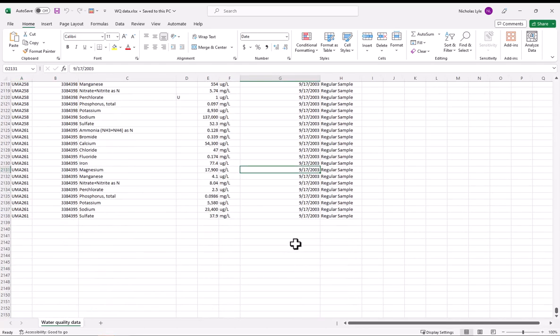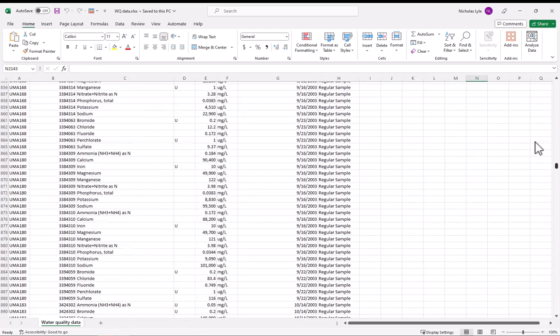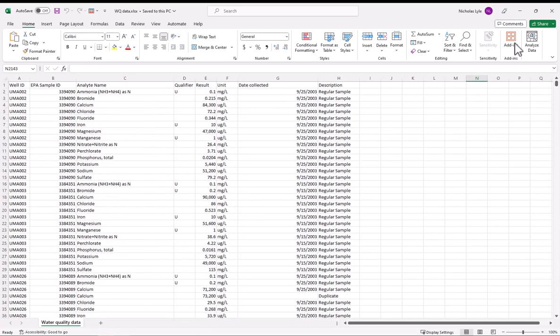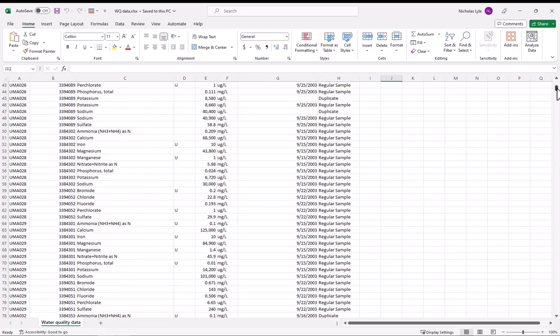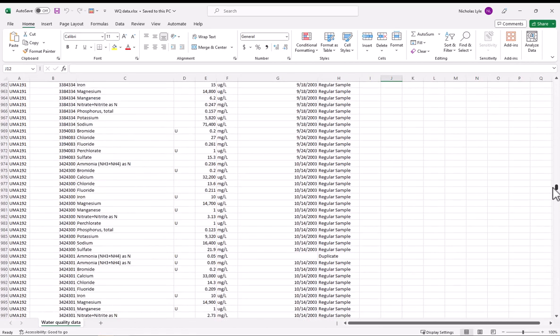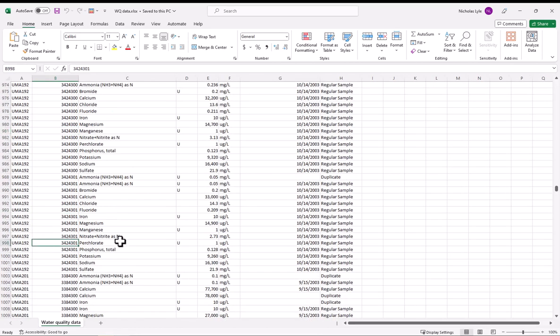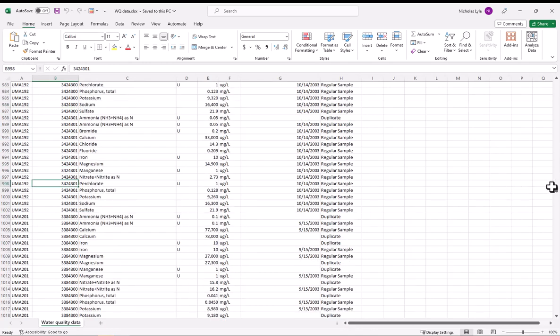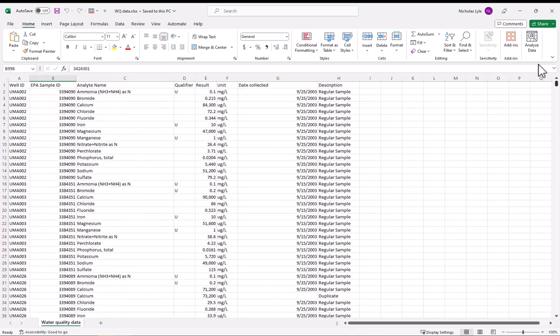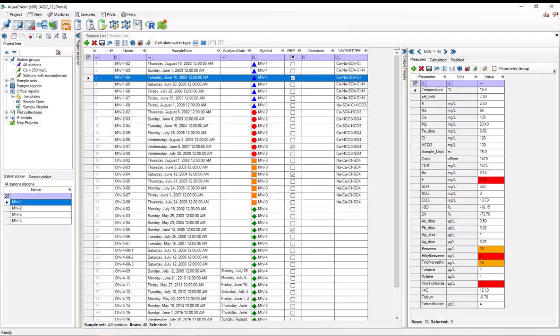There's no extra columns. We don't have things in here like, you know, row 1000 is another row of header data and so on. It's just one header and all of our data. There's some more preprocessing that I could have done here, but I'll talk about that during import. And I'll just go back to AquaChem.